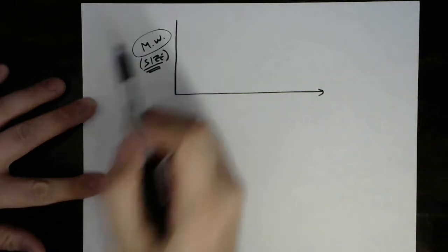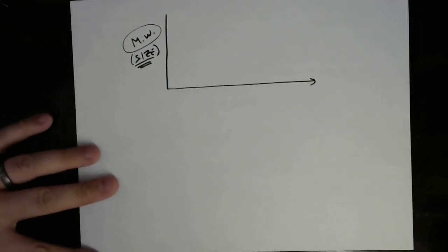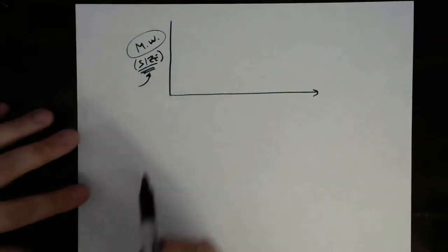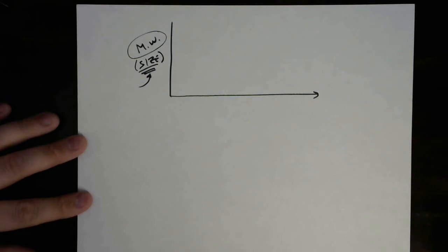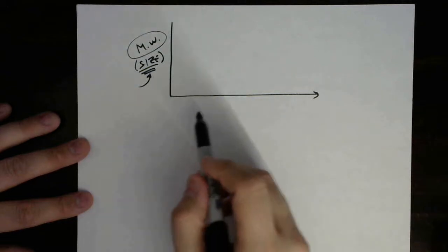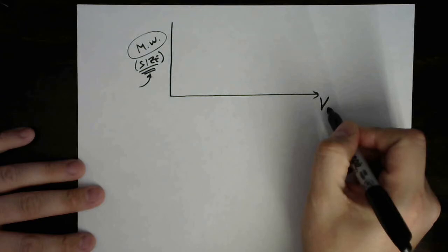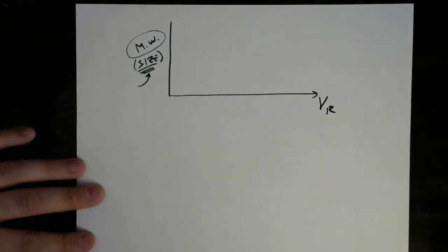It's very common to hear this reported as molecular weight, and that's because people are comparing their system that's very well defined, some highly branched polymer or some very low degree of branching polymer they're using this technique on. And so they basically are normalizing for the size factor. They consider this to be a molecular weight based separation. Okay, so we're going to plot that on the y-axis. We're going to plot retention volume on the x-axis.